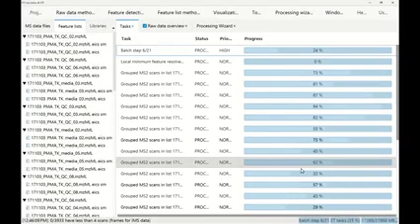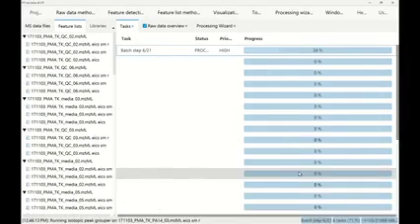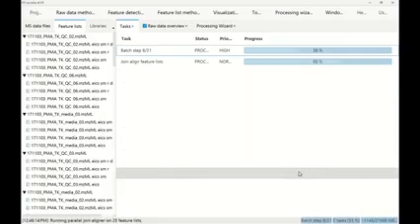And now if we click on the task in the bottom, so there's a task in the bottom, and you're going to see the task manager, and it's going to run all the individual steps. And the nice thing as a developer is I develop my logic, and it's very easy to parallelize everything here in Java.